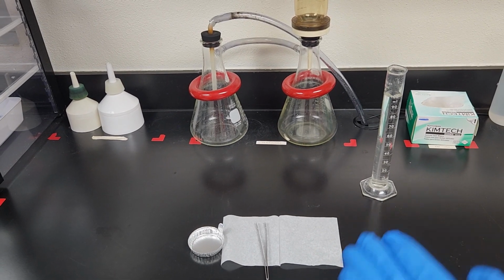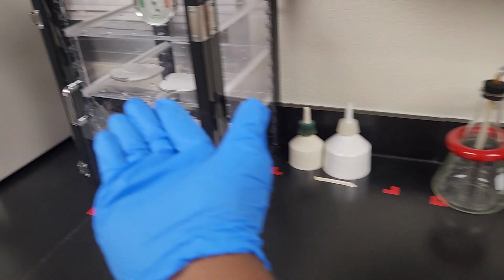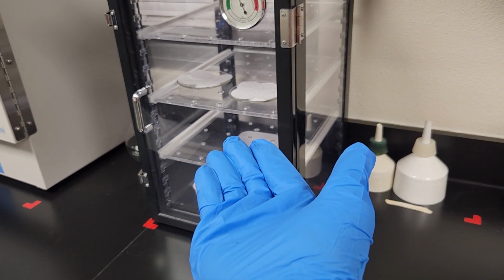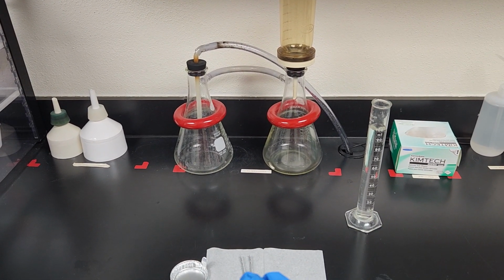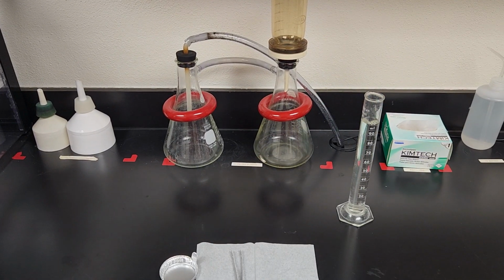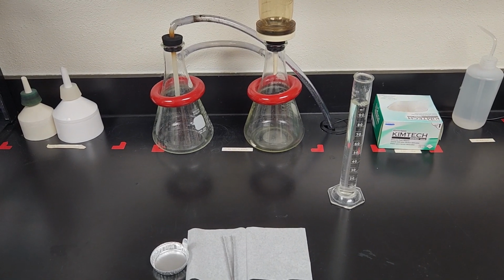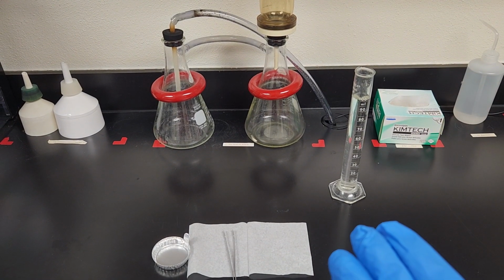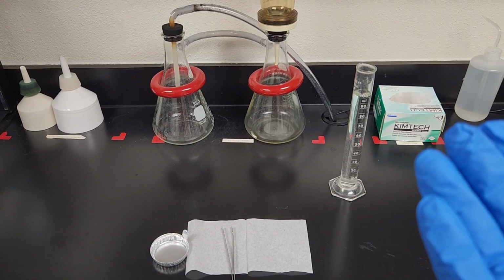In this video, we want to find the TSS of an unknown sample. We'll be using the filters in the desiccator waiting to be used, and after that we'll take the initial measurement of the filter without sample on it, and after the sample, I will do a subtraction, and that will help us know the total suspended solids of the sample in milligrams per liter.